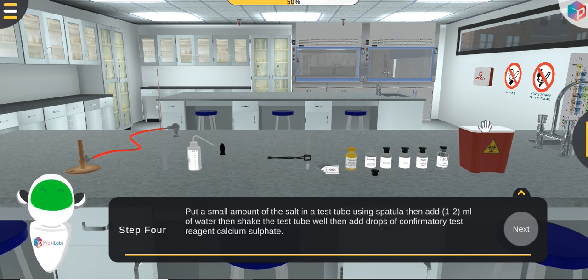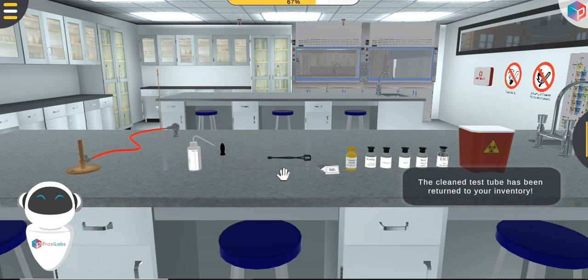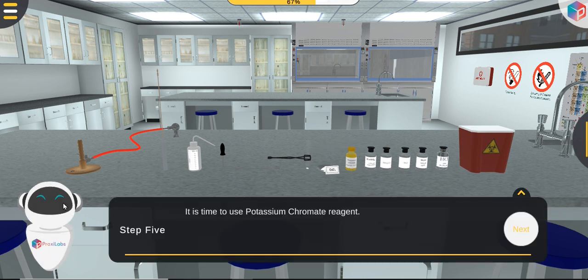On the next thing, I'll fetch the salt again.